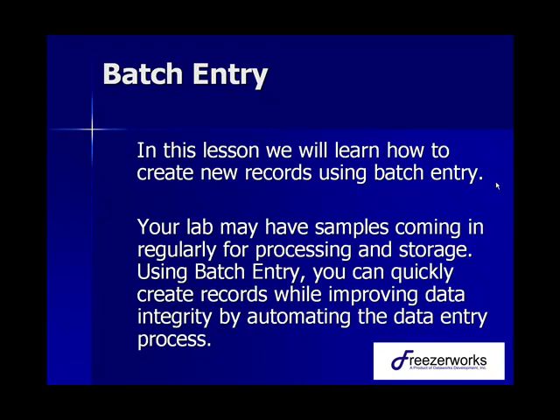Now, your lab may have samples coming in regularly for processing and storage. Using batch entry, you can quickly create records while improving the data integrity by automating the data entry process.